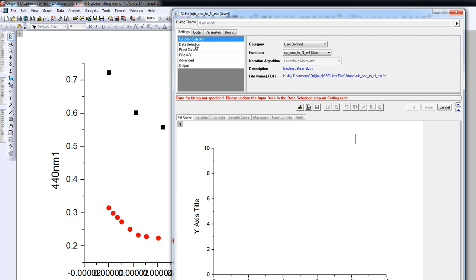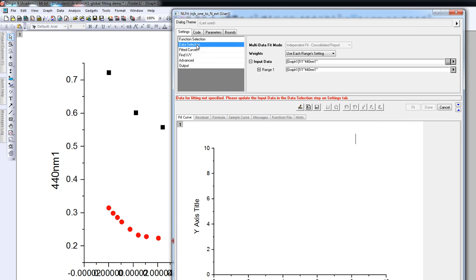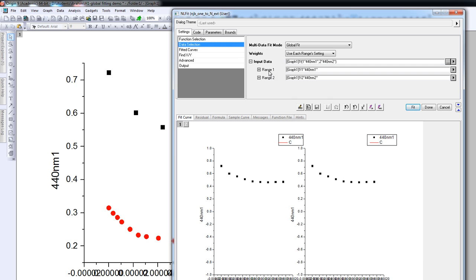What we'll do first is we need to select the data. If I click this, what I see is that one dataset has been selected. But actually I want to carry out a global fit, so I need to add a second dataset. I do that by pressing this little arrow here, which gives me the opportunity to add the second dataset in this graph. So we see the absorbance at 440 nm for titration 1 and for titration 2.